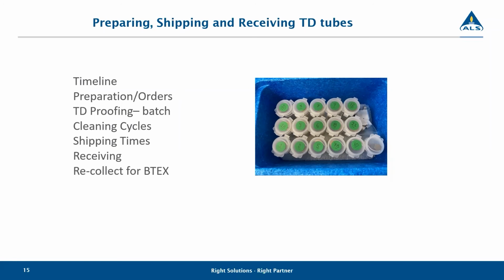When it comes to shipping, as you can see, this is one of our smaller coolers, and it actually has a foam insert that the little canisters sit in that hold the TD tubes.